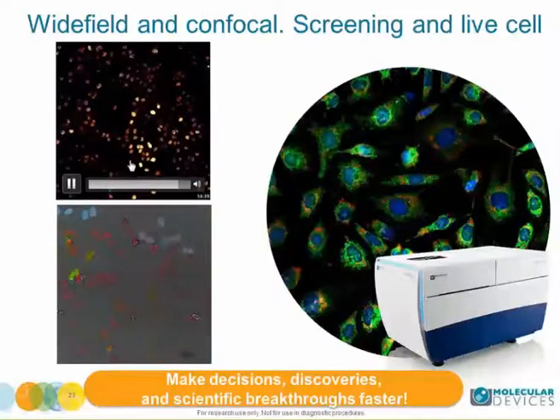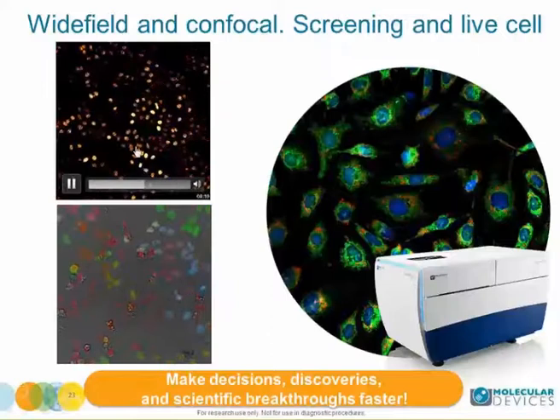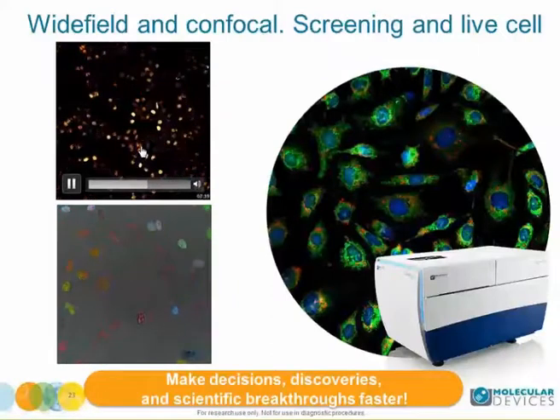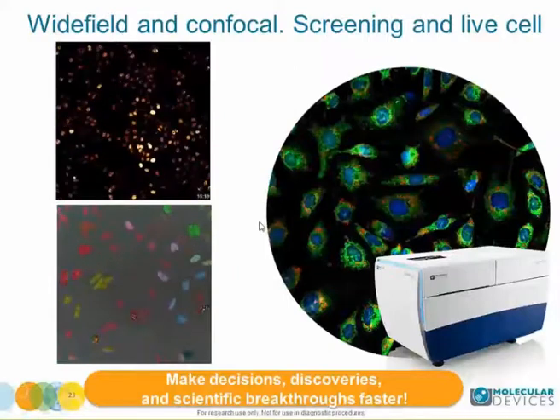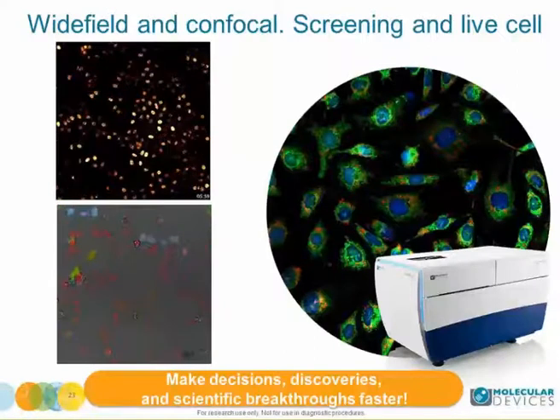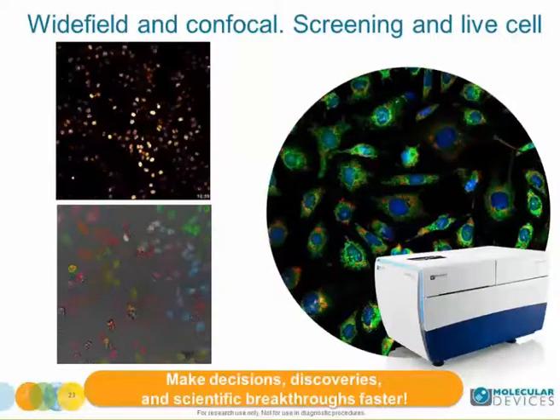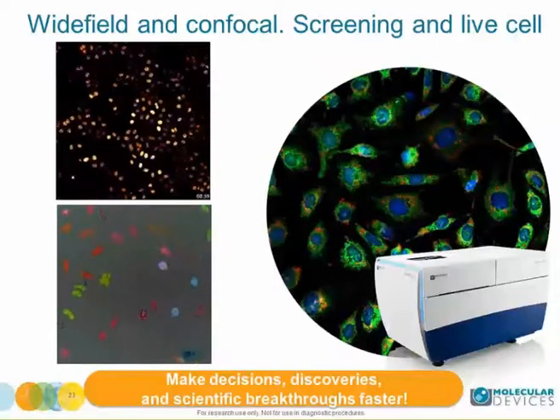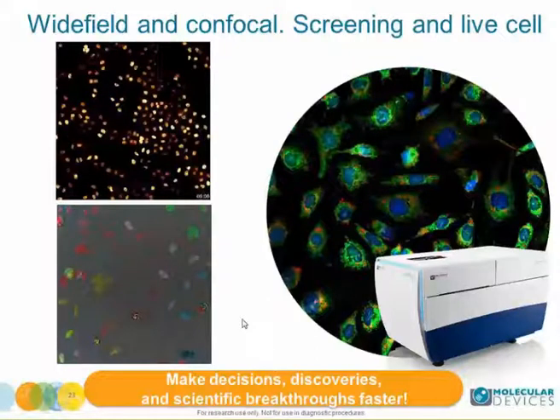You see cells go through and enter S phase, and here you can see these cells are dividing. So just because it's confocal doesn't mean that it's killing the cells. You can do that over a very long time course. There's a different example shown at the bottom that I'm not going to highlight. But again, a long time lapse, cells are going through their normal cell cycle events.